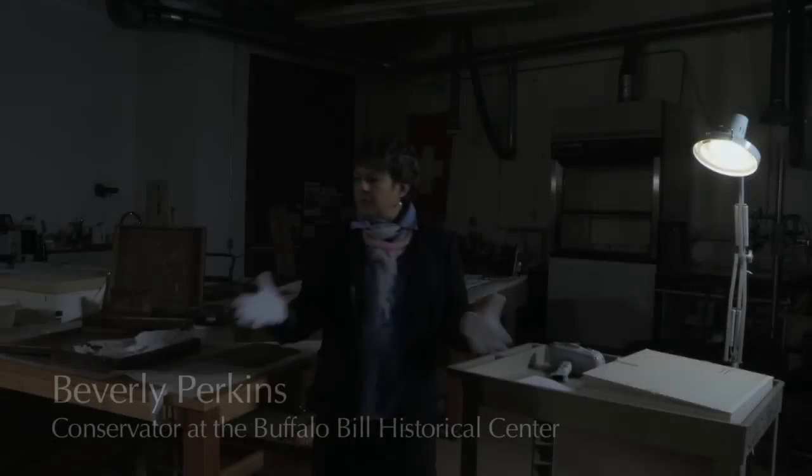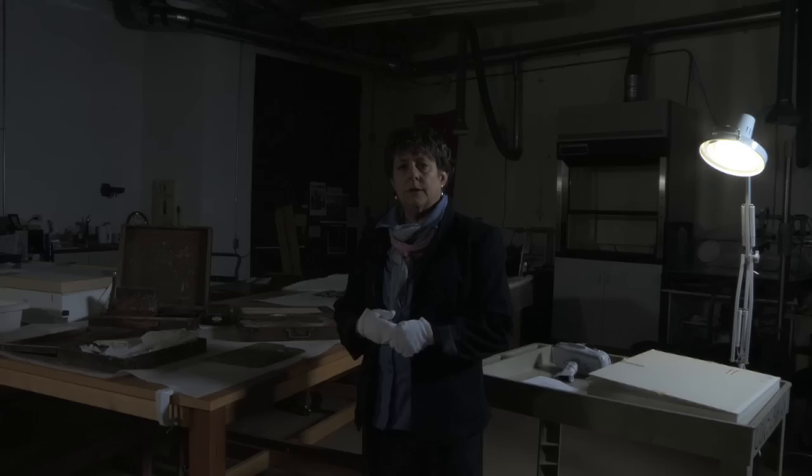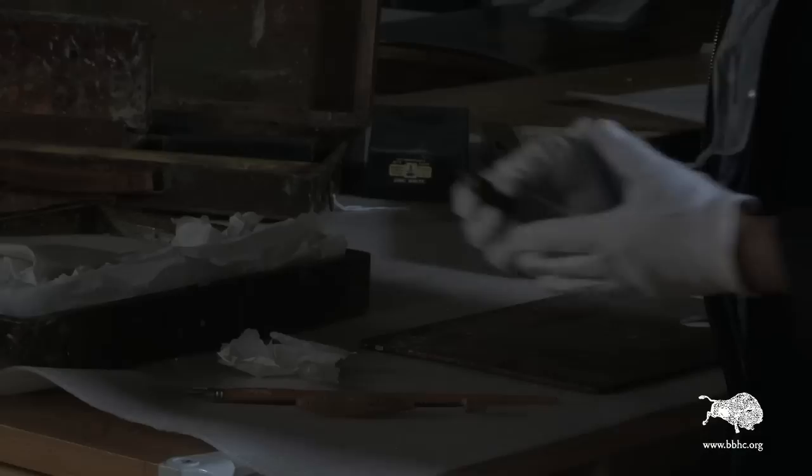We've brought a bunch of artist palettes out of the Whitney Gallery of Western Art closed storage for examination here in the conservation lab. Any of these clues you have to how an artist worked helps you determine whether a painting is really by that artist or by someone else.